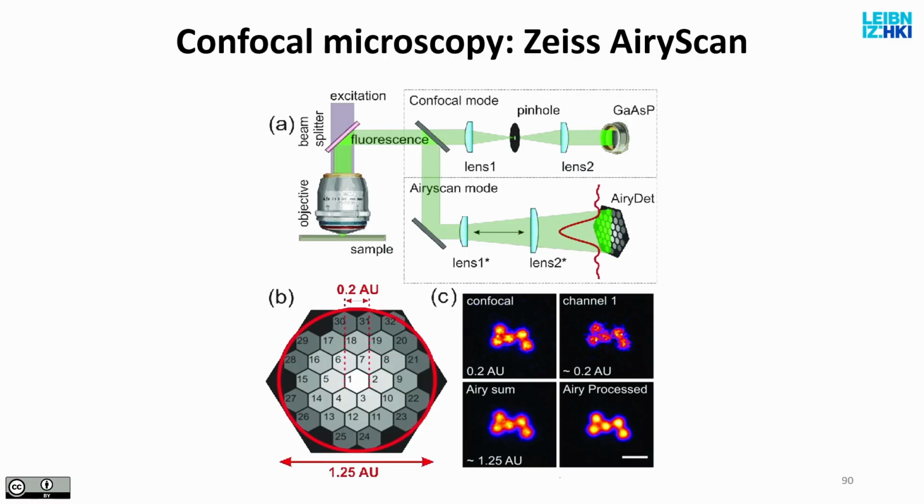And that's what you get. This is your confocal image. This is your Airy scan image. It's a square root 2 times increased resolution. And sometimes that's enough improvement in resolution to see something versus not seeing something. This unit costs you, I don't know, 50,000 euros or so, which is not much compared to the 1 million you paid for the microscope. It sits in a different box. It replaces the pinhole unit with this one, and you have a really increased resolution microscope.